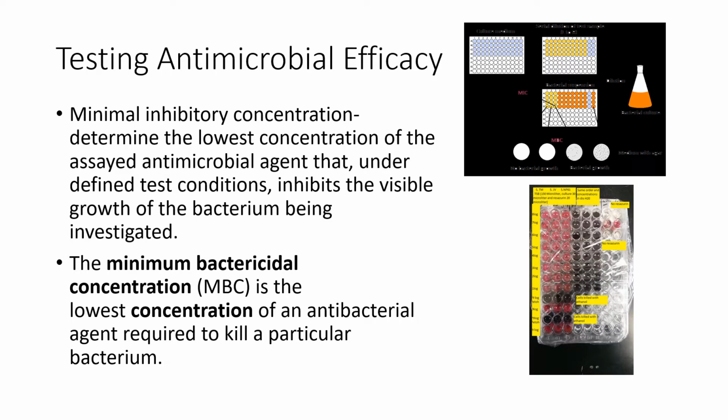So we spoke a lot about how these antimicrobials work against bacterial cells, but how do we know what concentrations work? When we say, hey, 200 ppm works well, how do we know that 200 ppm works well? Well, we do this by testing the antimicrobial efficacy of these compounds. Now, if you go to the EPA website, they have a bunch of protocols that help you figure this out.